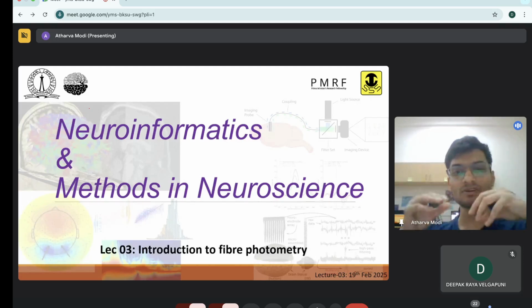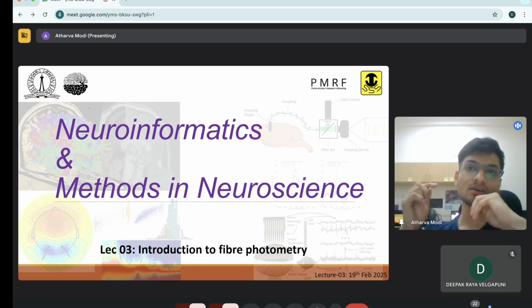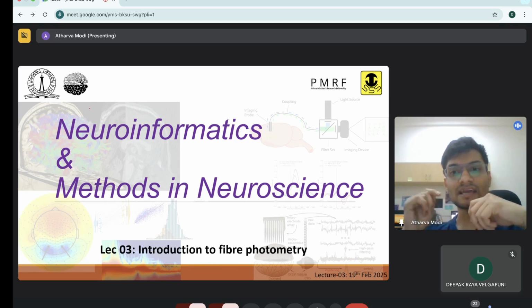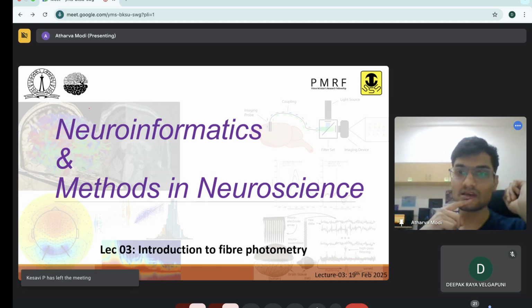But what I am going to cover is also a very innovative, very intriguing technique where we can record different kinds of brain activity, and we'll see what different kinds mean, using light. So by shining light inside the brain.